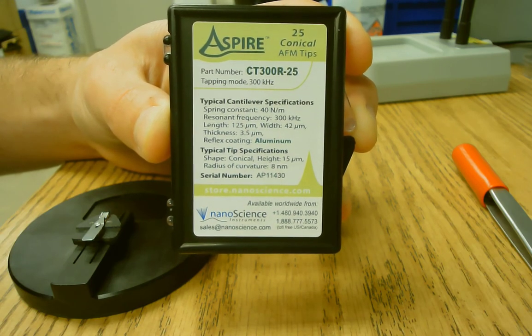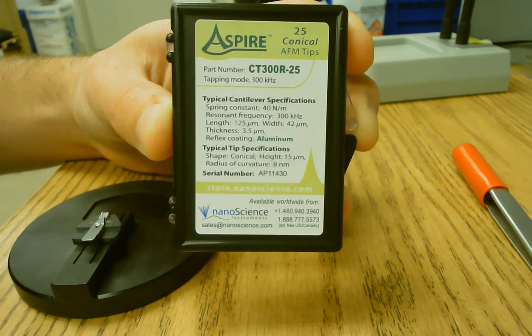So with these tips 8 nanometers is going to be the smallest feature that you can resolve. And maybe you can think about why that would be the case. And we can talk about that later.